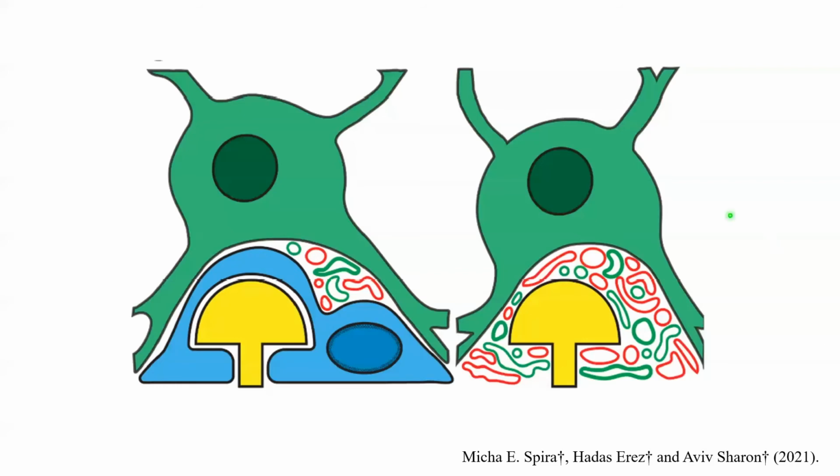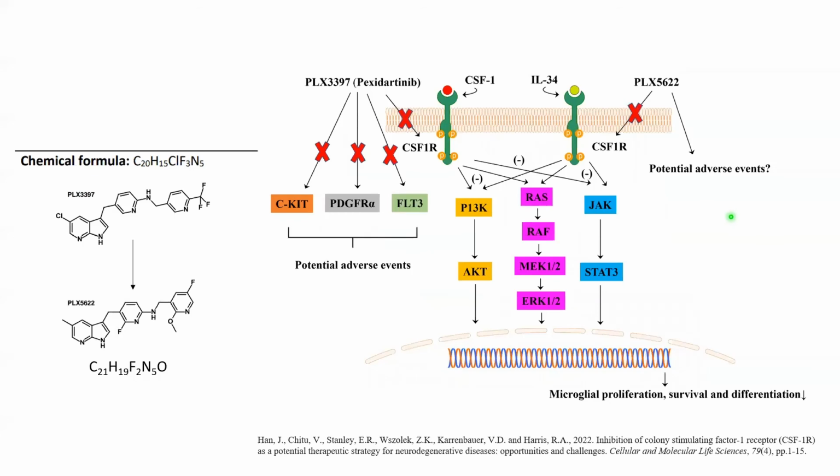So we had to start somewhere, and a good place to start is the main obstacle. Given the hypothesis claiming that microglia implant interfacing is a major component underlying the electrical insulation of the electrode, we began by searching for ways to specifically target and eliminate the microglia from the game. To do that, we used a pharmacological agent called PLX, that I will from now on pronounce as Plex. This is an inhibitor of colony-stimulating factor 1 receptor, which is essential for microglia proliferation, survival, and differentiation. Plex was proven to eliminate over 90% of microglia in the brain of mice.